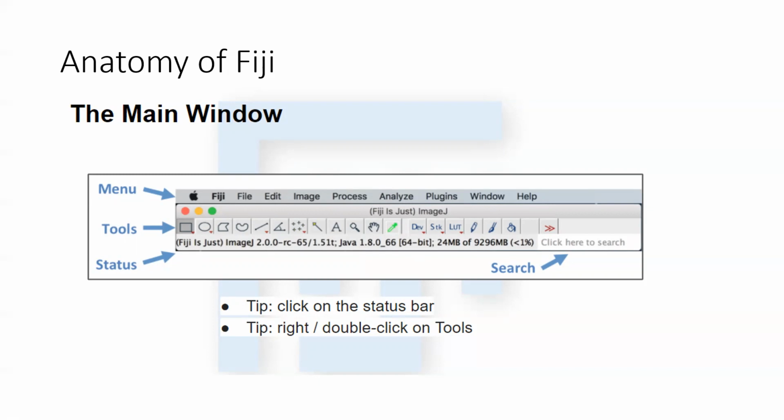Part of the reason this name comes about is that historically there are different iterations of Fiji. Fiji started as ImageJ 1, ImageJ 2. Then everybody was preparing their own plugins, and you would go and get a plugin from here, a plugin from there. Things got so crazy that people started having forums, saying, all right, we need a common ground where everybody can deposit their material and things are easy to access. That's where Fiji comes into the picture: it comes as a package with all the bells and whistles in it.